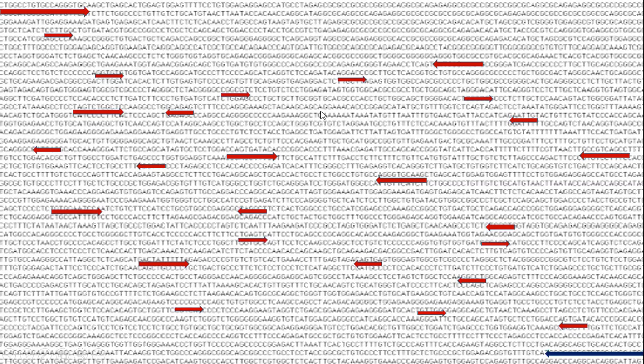So given the same primer I use, random sequences of ATGCs, given a genome here, it may go and bind randomly in the given location. Then if I run a PCR, for example here, what do you expect? What do you expect if you run a PCR using only one primer in both forward and reverse direction?